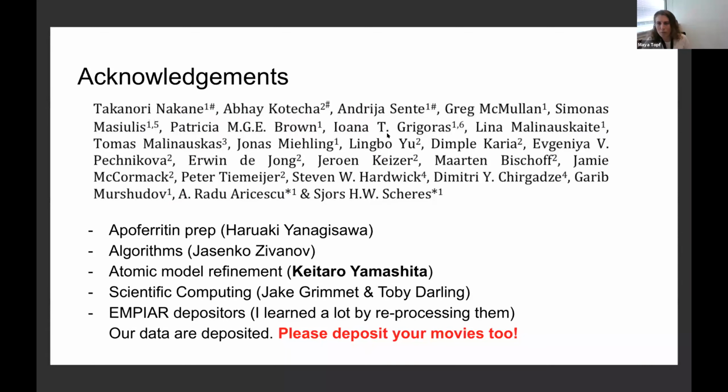Okay, thank you. Alistair Burt is saying, great talk, Takanori. Would you mind explaining how you chose the group sizes for your beam tilt, astigmatism, higher order aberration refinements?